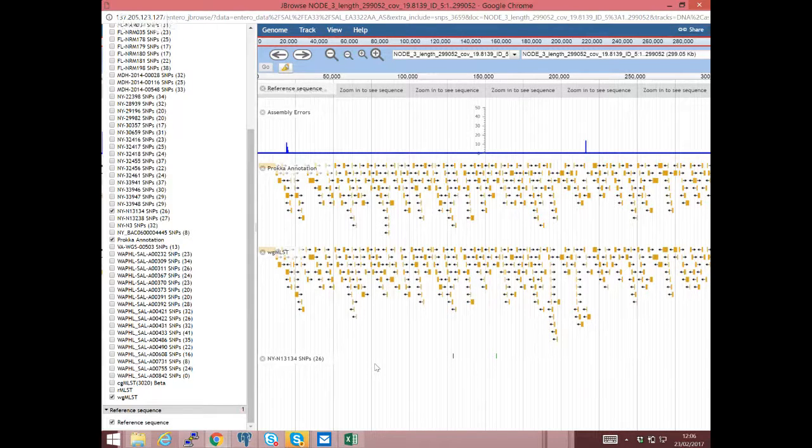Sometimes you get to regions where there are no SNPs and people don't understand why. It might be because there was no contig mapping there, or it might be that they were masked out because they're repetitive regions. So I also need a track which shows the masked regions as well. So this is still in development.